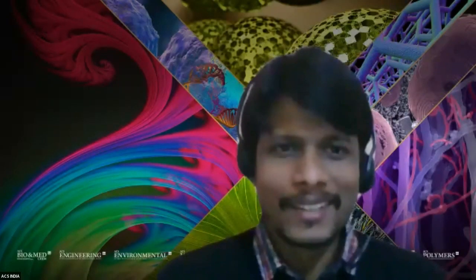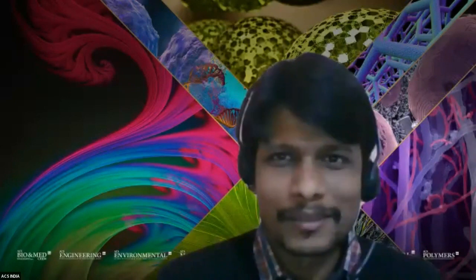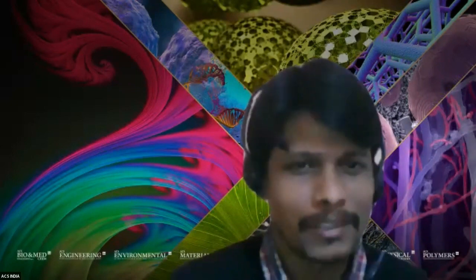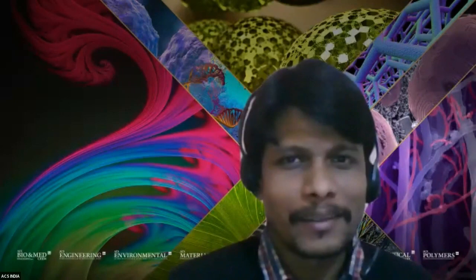So again, we have a question which comprises smaller questions, but I'll take a few of them. How did you process your samples for protein analysis using Raman spectroscopy? This is the first part, Professor Umapathy.